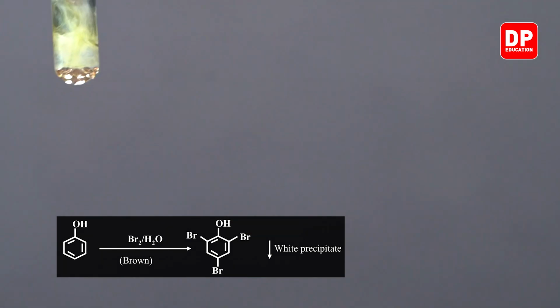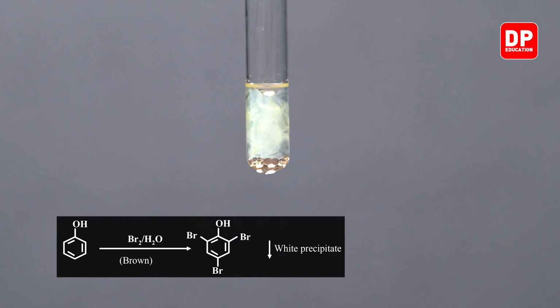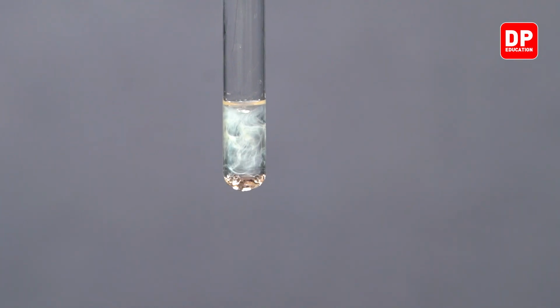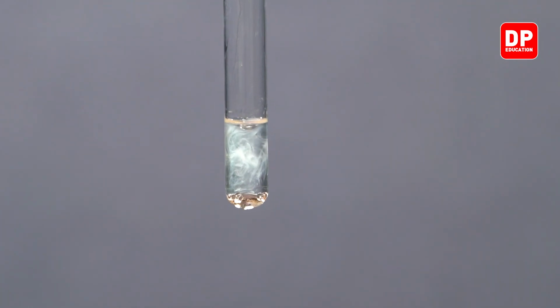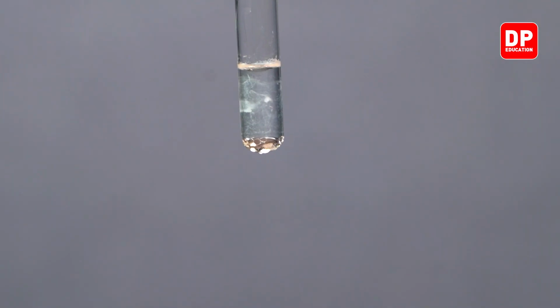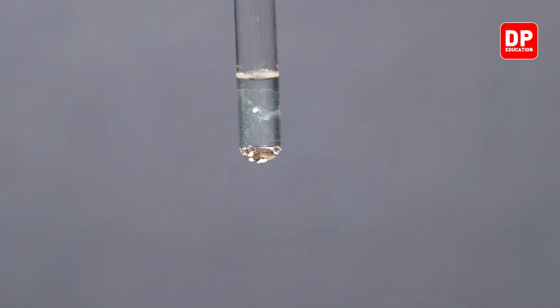As you can see, upon addition of phenol into bromine, you can see the color of bromine water disappeared. At the same time, I hope you can see the formation of a white color precipitate or white color powdery substance inside this reaction mixture.